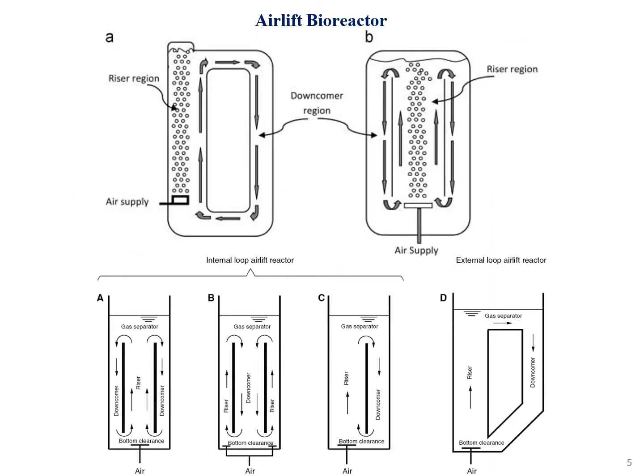Moving on, we have the airlift bioreactor. In this airlift bioreactor, the air is supplied from here. We have the riser region, from where the fluid gets raised up through an air loop system, or an internal airlift system. That's why it's called an airlift bioreactor, and it has a region that moves circularly from up to down.